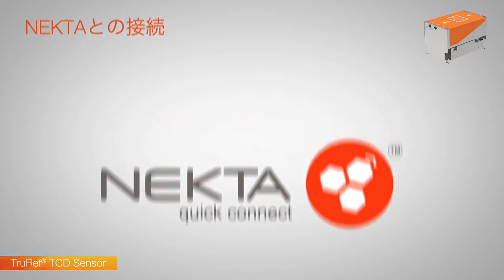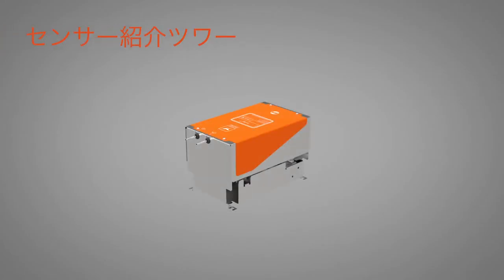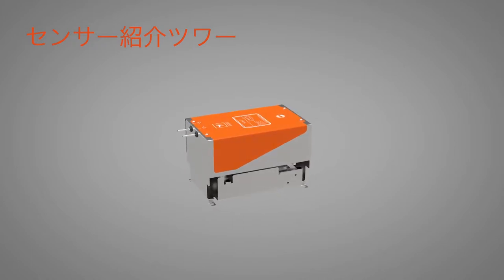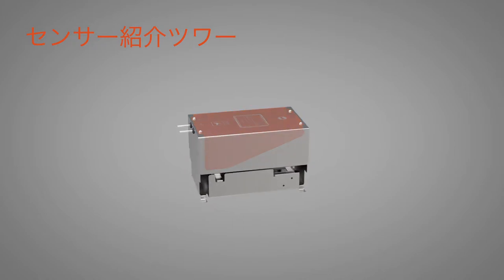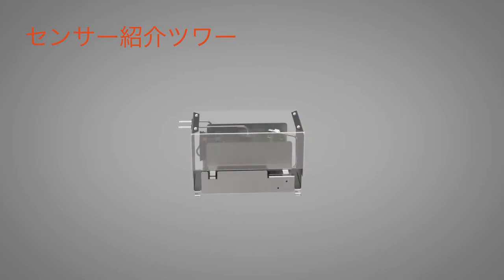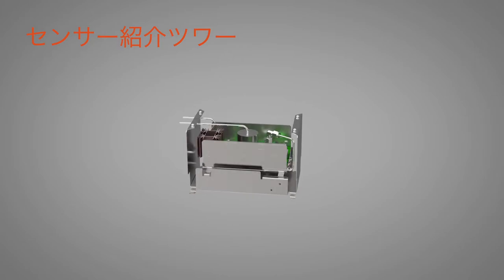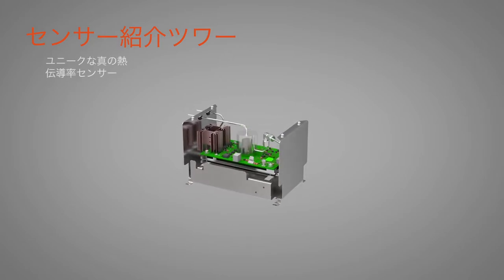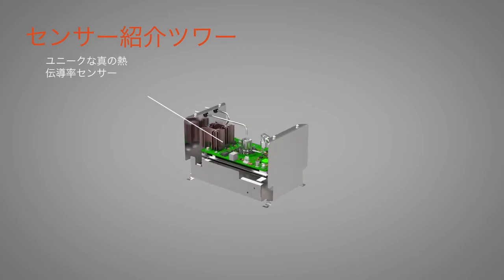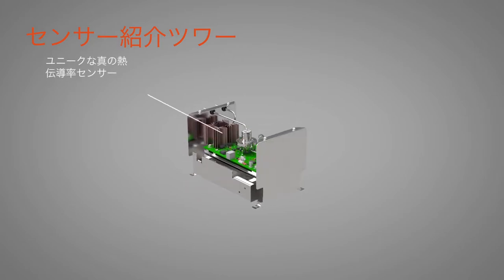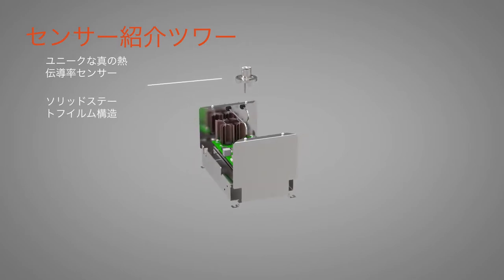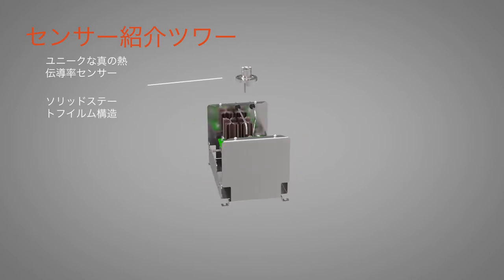The sensor has many unique features and benefits. No reference gas is required, which means lower running costs and less potential for instability. Both measure and reference elements are held under isothermal conditions within the sample gas.